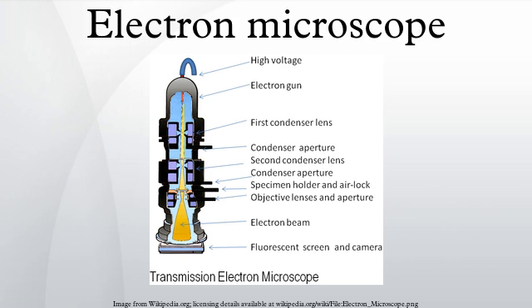Optionally, the standard secondary electron image can be merged with one or more compositional channels, so that the specimen structure and composition can be compared. Such images can be made while maintaining the full integrity of the original signal, which is not modified in any way.